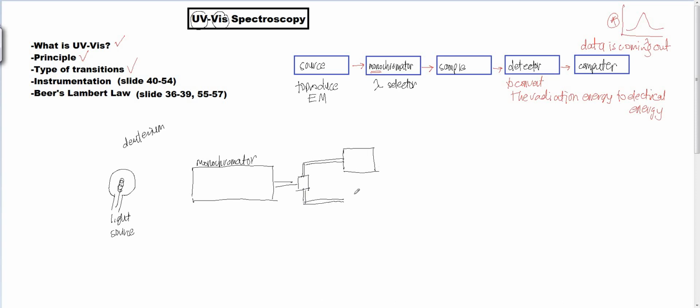Okay, yang mana we have one here and then we have two, okay, so this one we call it as a sample holder, yang mana one we have to put the reference, okay, nanti biasanya dalam lab kita akan explain lagi on this one, you akan nampak lagi lah based on the video yang kita akan tunjuk, right? Okay, and then it has to be connected into the detector, right? Of course, why? Because we want to detect. So that's why the last one kita ada computer lah.